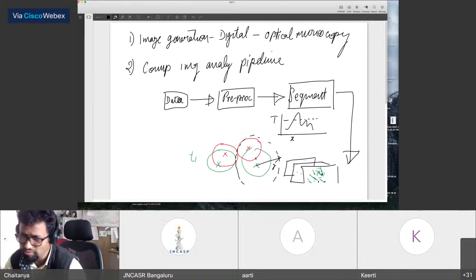And now, of course, if the object is very large, if the movement is dependent on the size, then it is likely to move less. So maybe there your R might matter as a function of size of object. What is much more important, and this is what I was trying to emphasize earlier, maybe it didn't come out clearly, is the extent to which it moves.